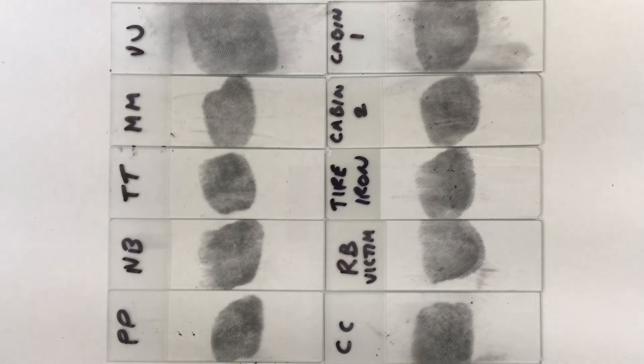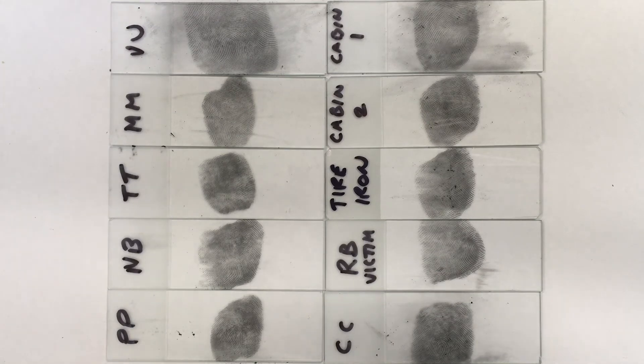Here are all of the swabbed slides and prints for you to see. It's actually much easier for you to compare those slides directly than for me to extract them and line them up using sticky tape. That would be a forensic technique that would take place in practice — say you had an actual surface at a crime scene, from a window, wall, or hard surface. Obviously you can't just cut out that print and bring it back to the lab, so in a lab scenario they would extract that print from the surface as best they could.